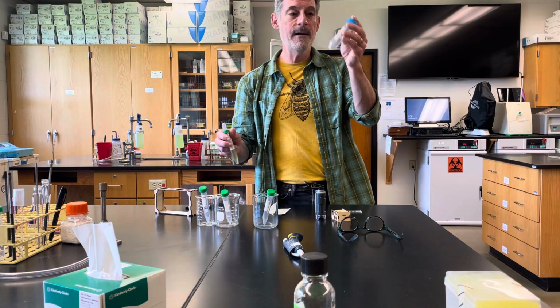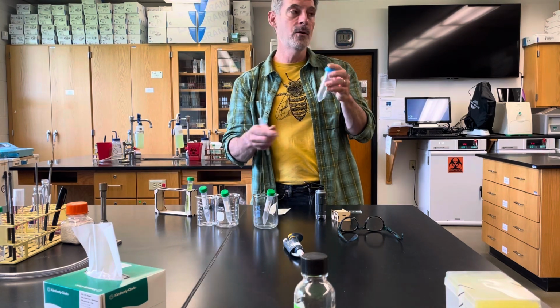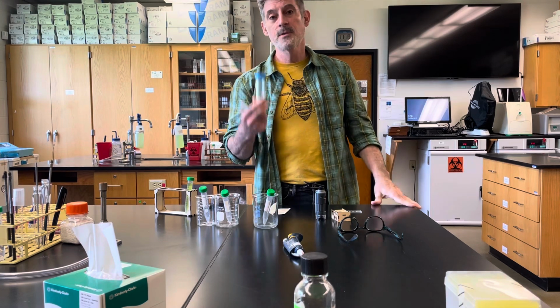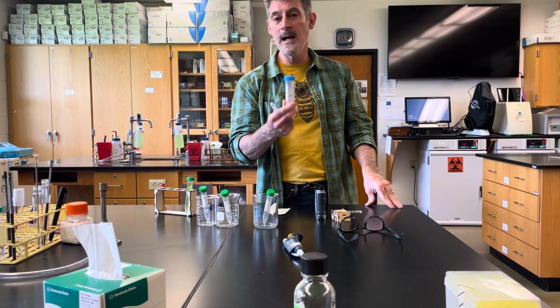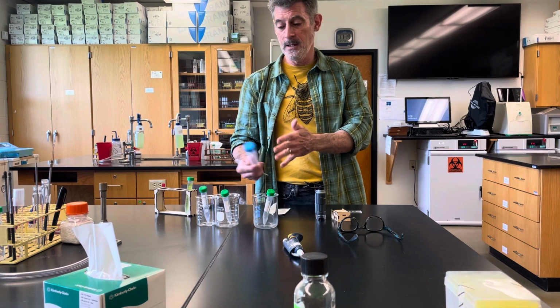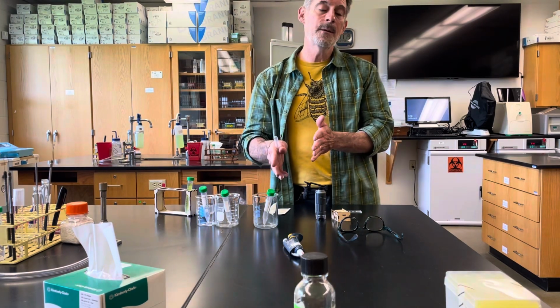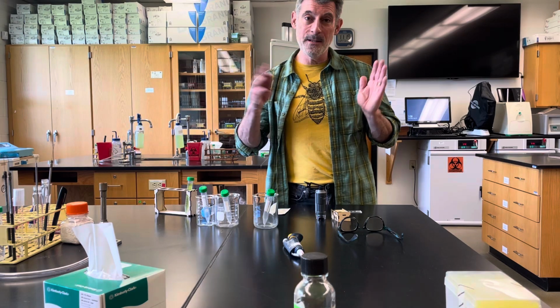So you have a container in your kit that is full of water. Right? It is salt water. So you need to use that salt water when making up the tubes for this experiment. The rest of the experiment's the same as the previous experiment.